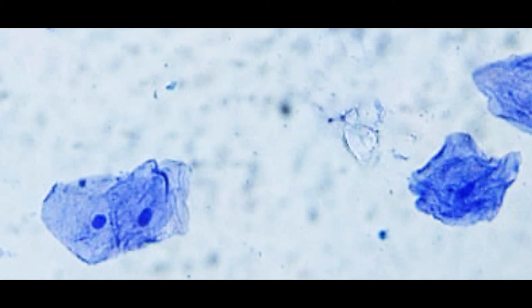So yeah, take that and put it under the microscope, and this is what you should be seeing. It's very normal to have a lot of cell debris, cell fragments from maybe too vigorously swirling your toothpick in the water.